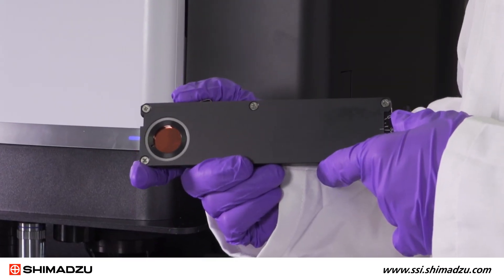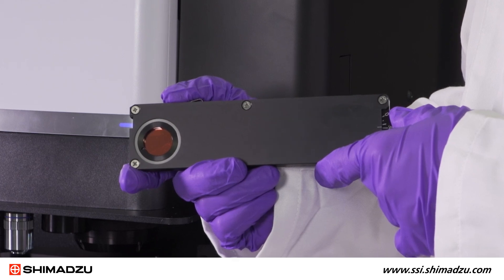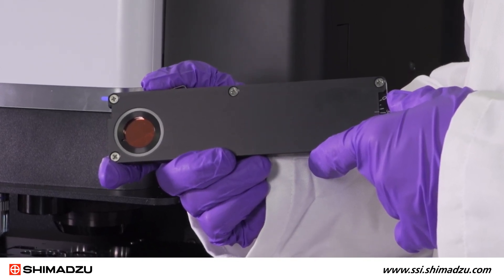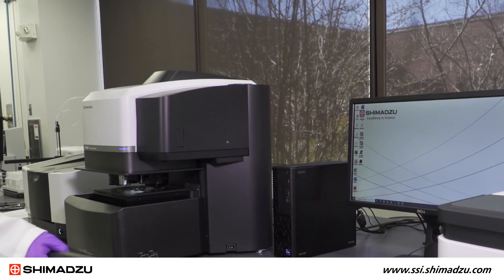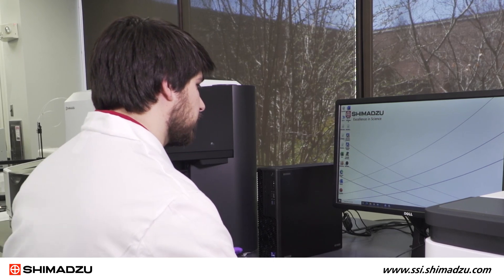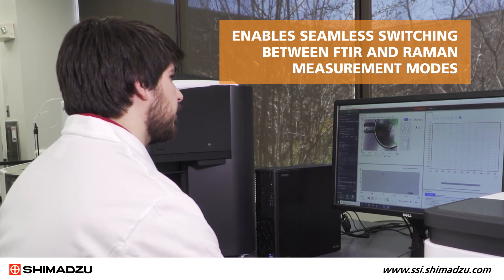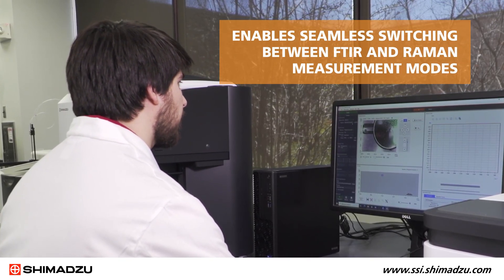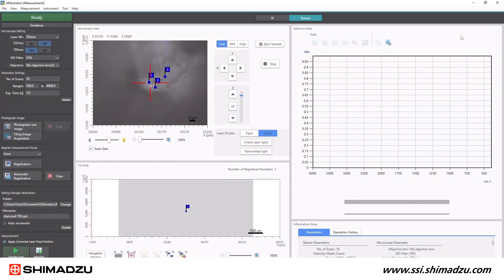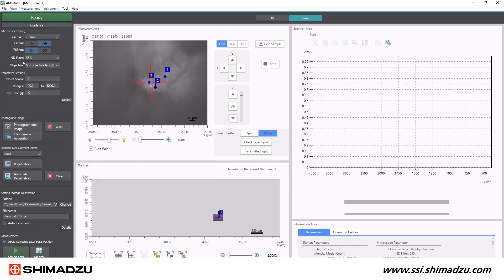Additionally, there are options to polarize the visual image and the IR radiation during measurement for additional sample information. The AirSight is controlled by our brand new AM Solution software, which enables seamless switching between FTIR and Raman measurement modes. The sample never has to leave the measurement stage and there is no reason to search for the same sampling spot between measurement modes, reducing valuable sample prep time.